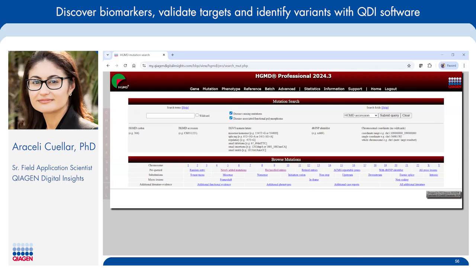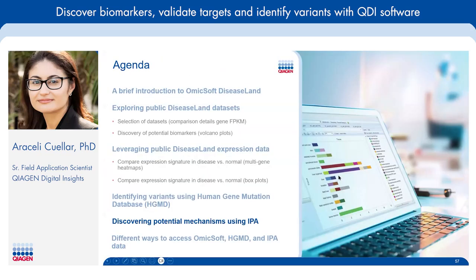Very cool. That looks like a pretty easy to use search tool. All right, so I'm going to hand it back over to you. There are no other outstanding questions. And once again, I will share today's slides in the chat box one more time in case you missed it, and take it back over, Araceli.